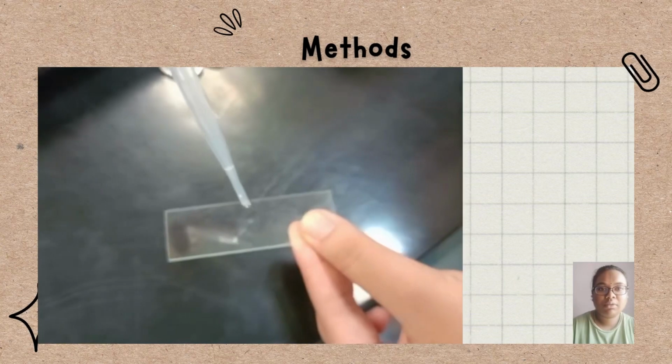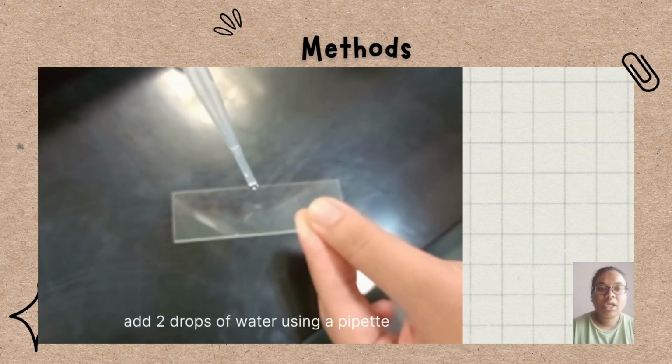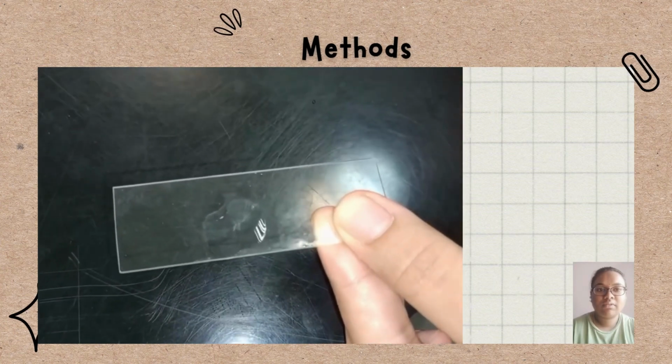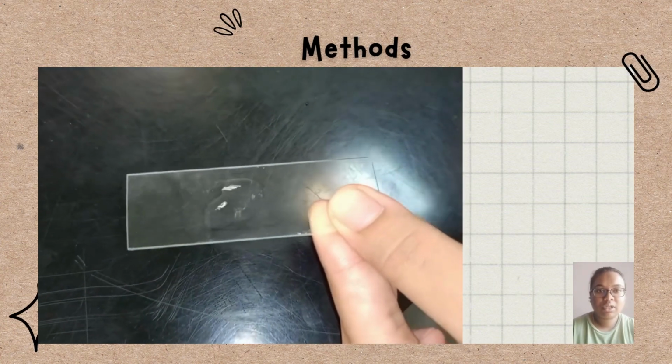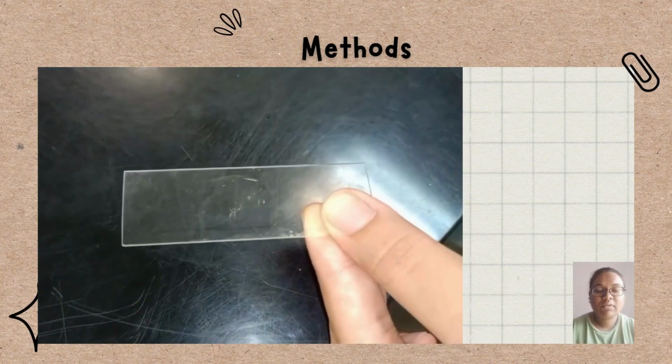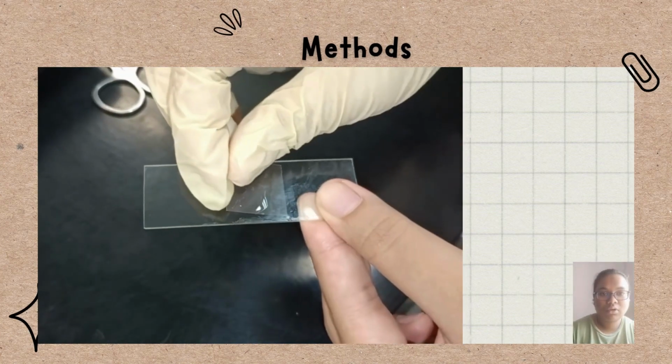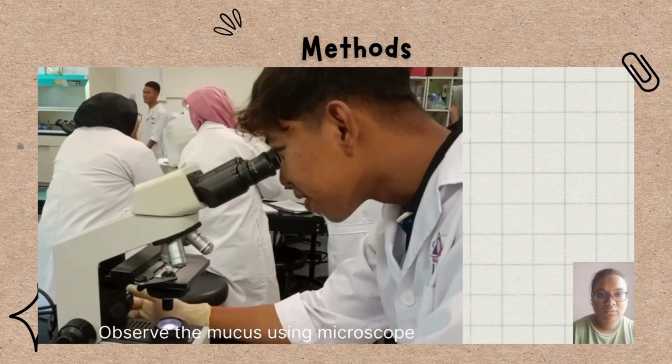Sampling procedures implement standardized methods to ensure representative samples. Select the sampling location considering factors like water depth, temperature, and habitat features. Identification of parasites: examine each specimen under a microscope. Use forceps to handle specimens carefully.